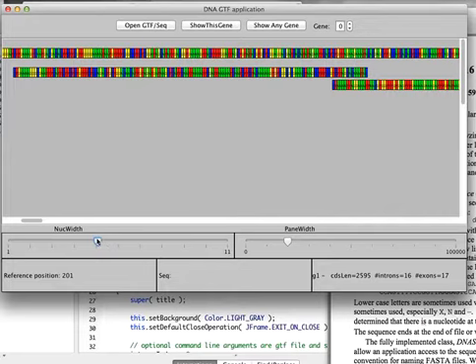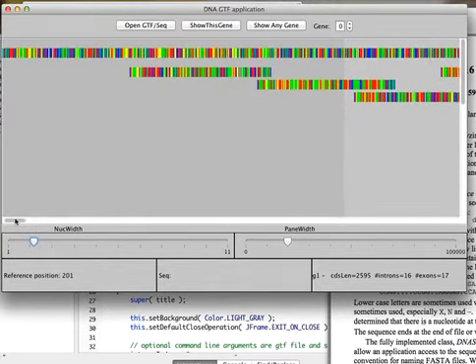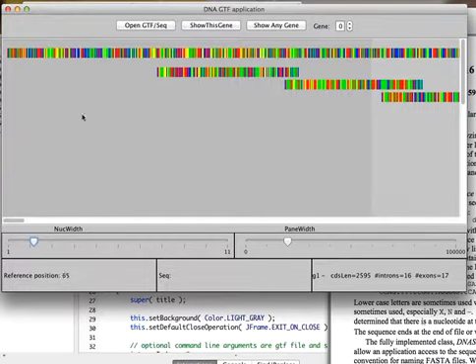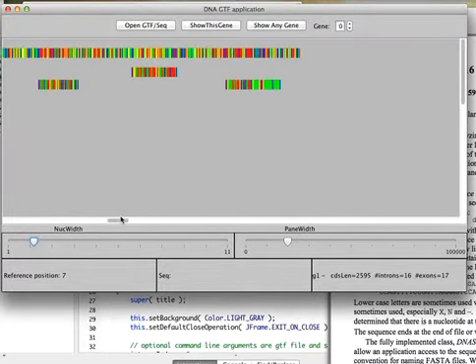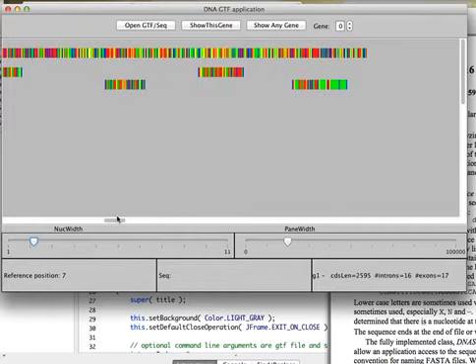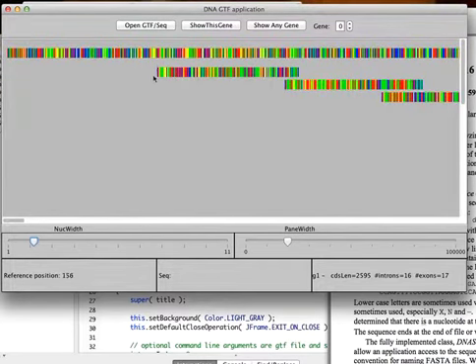And so that's what we see here, and the purpose of this program is to show the coding sequence, which goes on for quite long, almost 2,600 nucleotides, and then where in the gene that coding sequence is interrupted by introns.